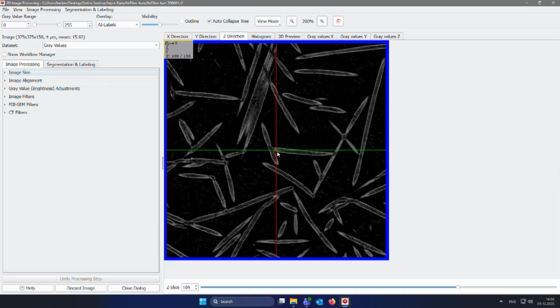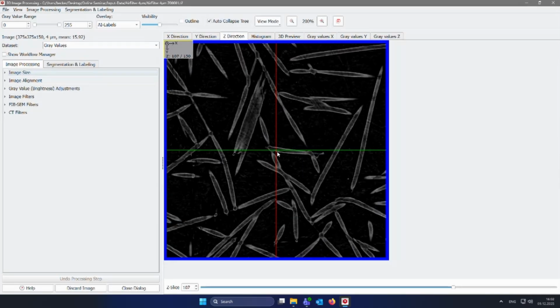You then have to turn these gray values into material information. So that means you have to decide which voxels belong to fiber, in this case. This is not always straightforward, and you need good tools for it. So here, for example, the fibers look hollow in the image, but in fact they are not, and you need AI to get a good segmentation here.